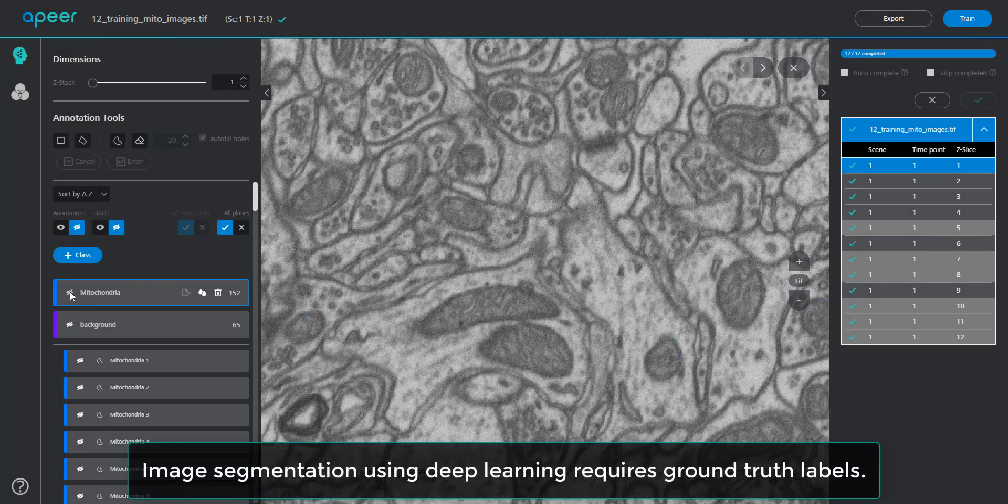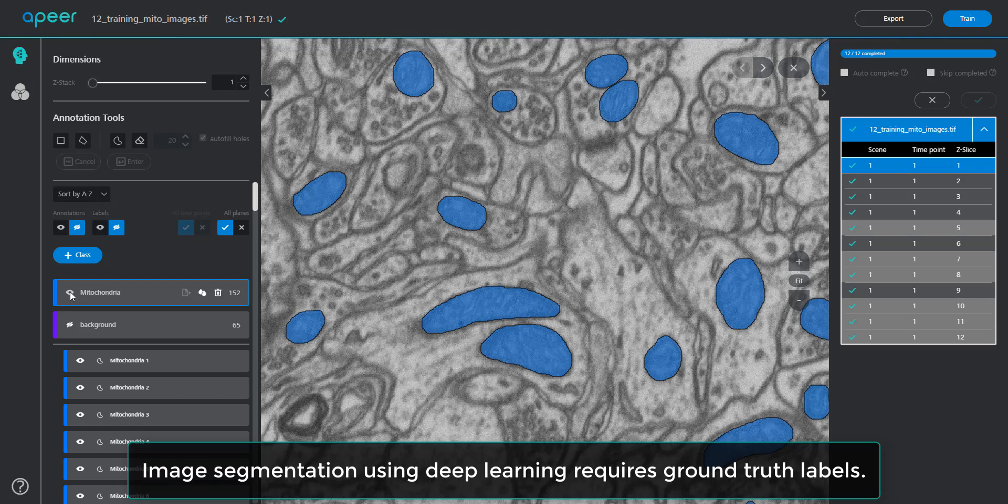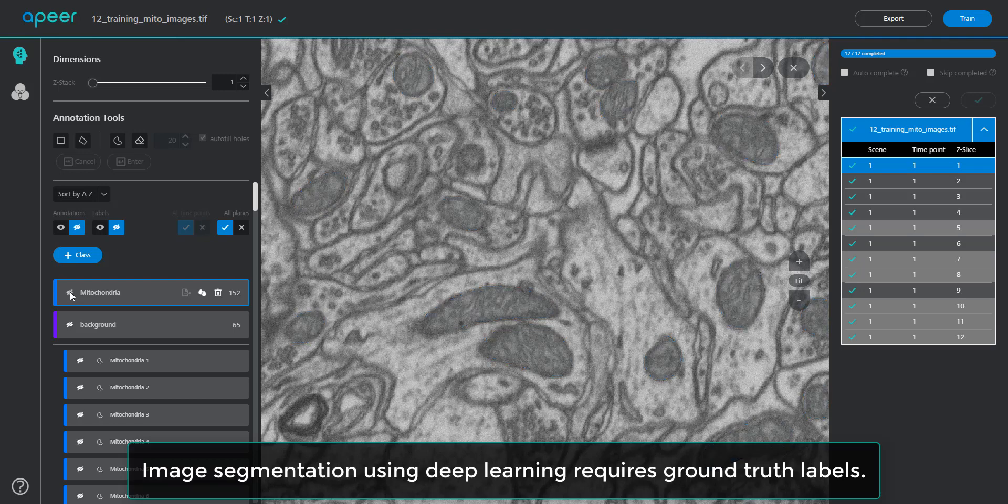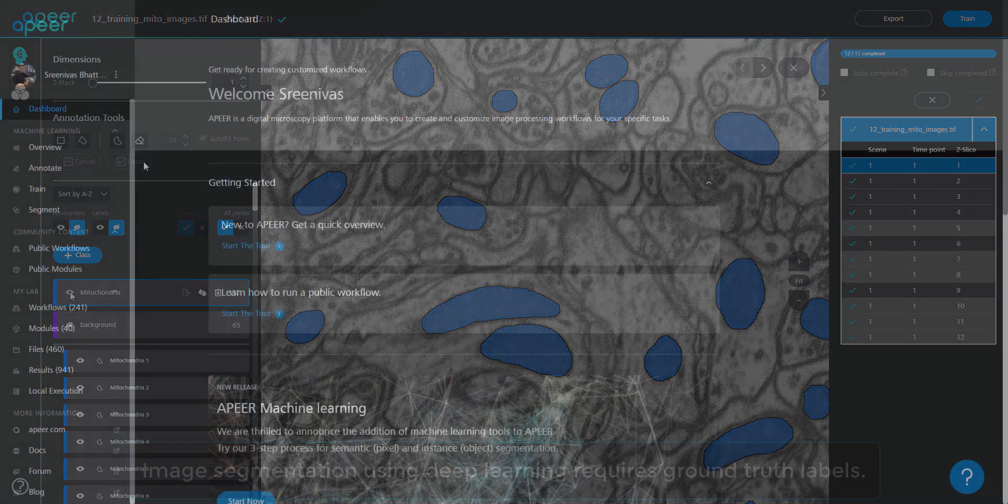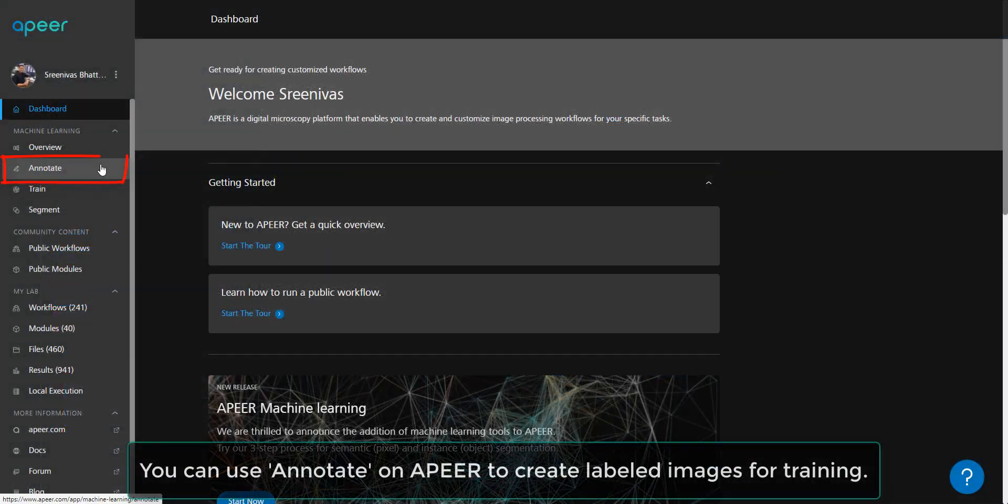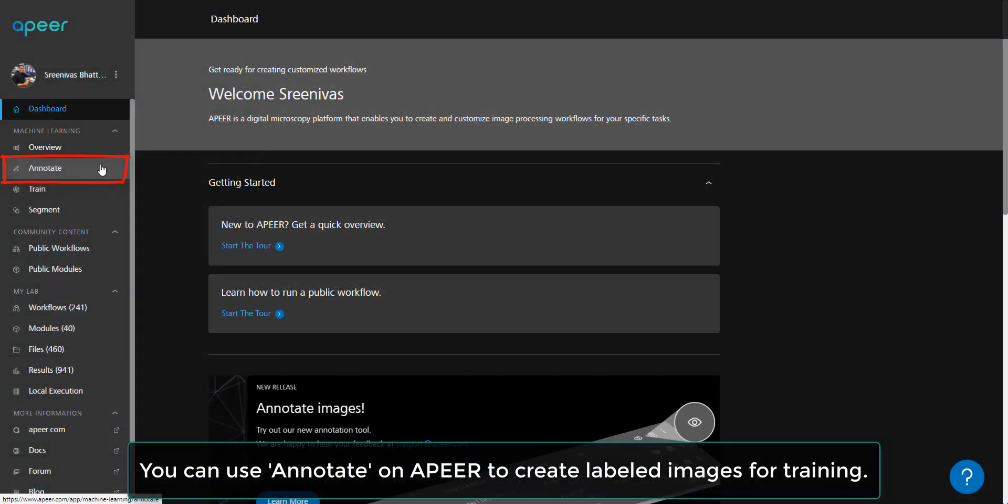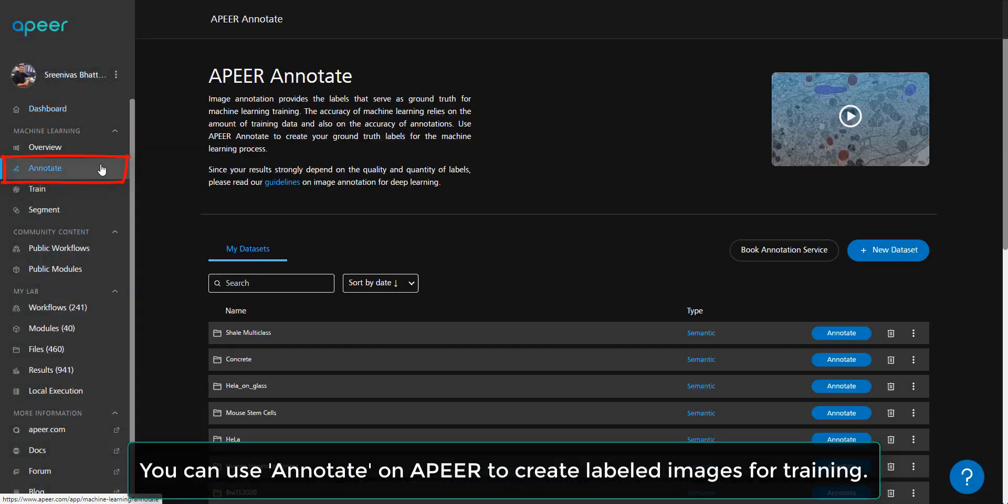Deep learning techniques for image segmentation require ground truth information as annotated images to train a model. You can annotate your images for deep learning using APEER Annotate.